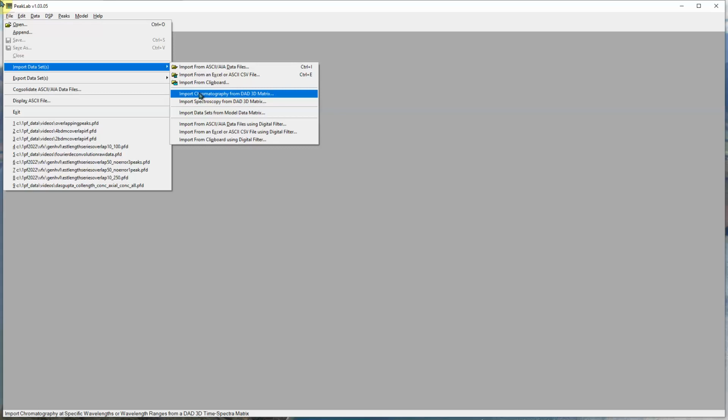When I first wrote PeakFit, its primary use amongst scientists was to analyze data with overlapping peaks. You use nonlinear fitting to resolve what you could not get with conventional instrument integration software. The greater the amount of overlap, typically the worse the inaccuracy, and at a certain point the two overlapping peaks would be treated as a single peak without at least some form of manual integration.